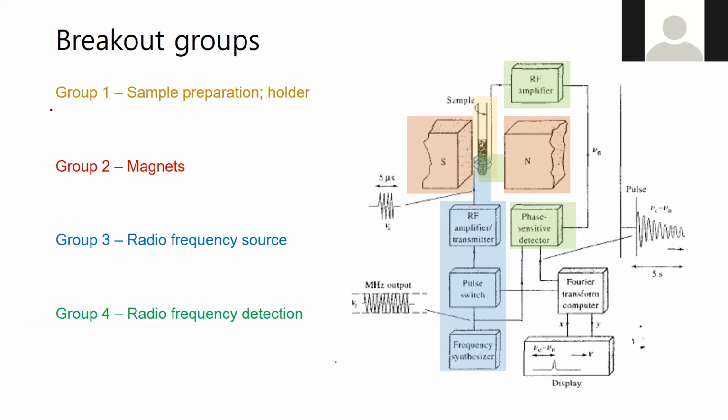I have a fair amount of experience in actually doing this, so this is mostly firsthand accounts of me preparing samples. With your sample preparation, a lot of these NMR samples are prepared in small little glass tubes, kind of similar to what you can see in the schematic on the screen.